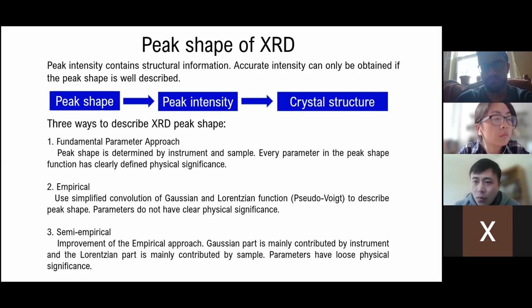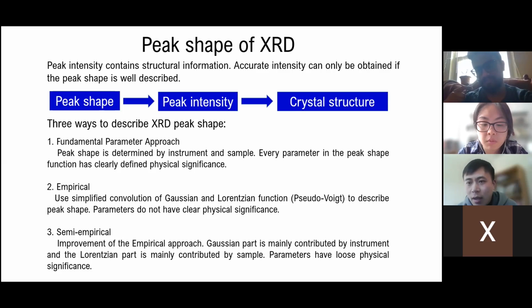And also we explained why we need a high flux, high energy X-ray to do the PDF, because we want to access the high Q range. We always have very weak peaks at high Q, so we need a high energy, because the higher the energy, the higher the Q you can achieve.